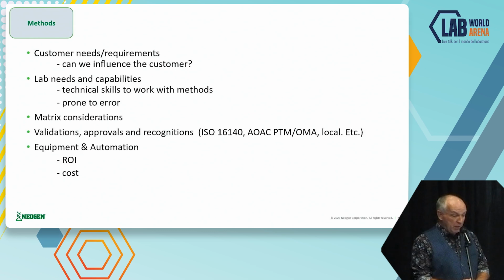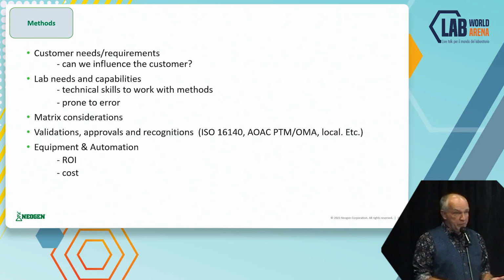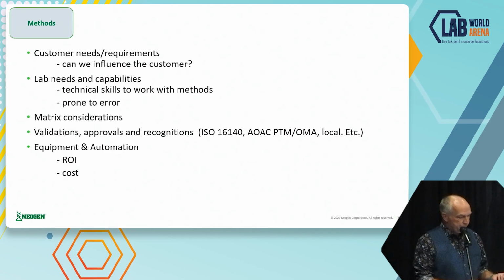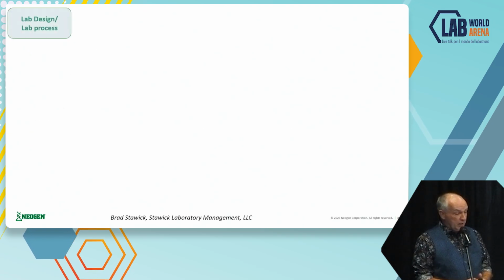I talked about methods. Customers expect a method. Can I do the method? Can my lab perform this method? Can I work with this method? So you know the process of verification. You need to assure people are trained on it and are comfortable using it. I don't want to go into all these details. I would more like to go into a kind of case scenario that we see, or I saw many times, and where we can support.